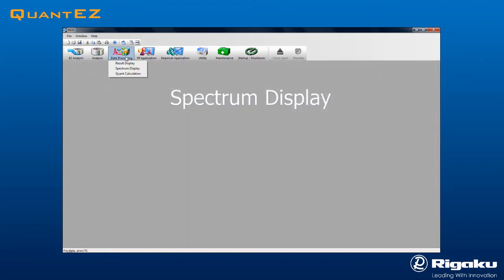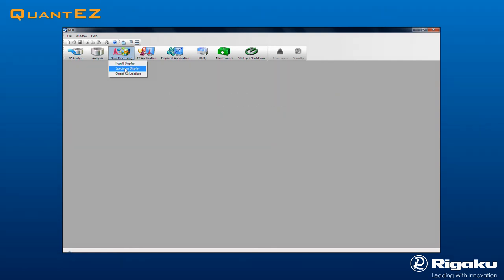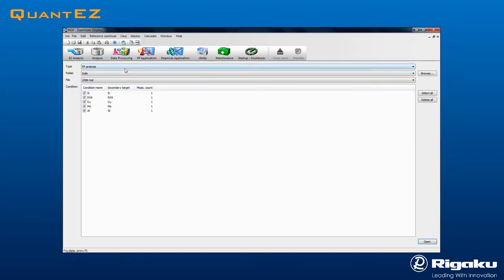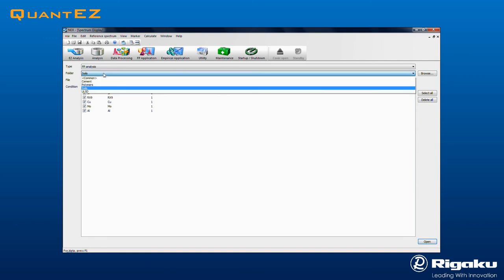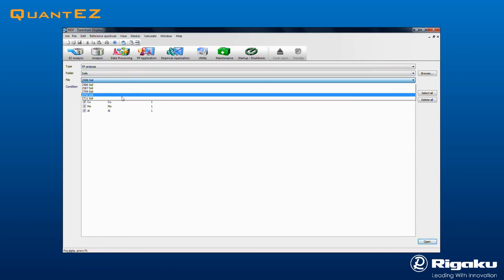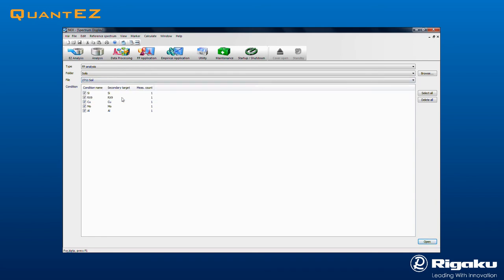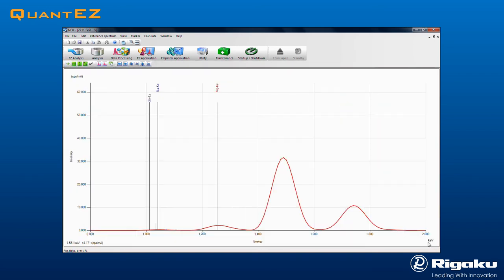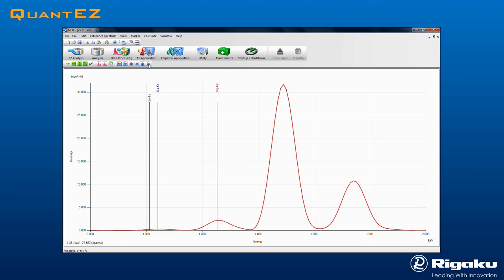To view the spectra from any sample, click the Data Processing icon and select Spectrum Display from the drop-down menu. These data views are useful for qualitative analysis and forensics. Find the desired data folder and select a result to view. Click the Open button. Zoom controls are used to view trace element peaks.